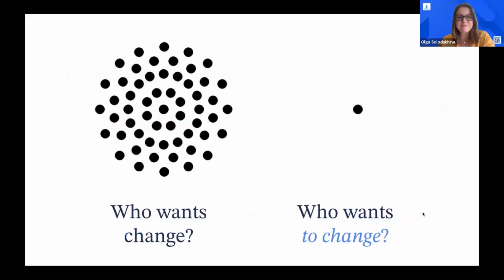And when it comes to change, I really love this slide, when we talk about change, everybody wants change, right? But who really wants to change, that's a big question. And when it comes to picking the LIS system, the decision is very difficult, very complex, very time-consuming, and you need to set up a really huge LIS decision committee, usually when you're a big lab and organization, and there are so many people involved in the process.